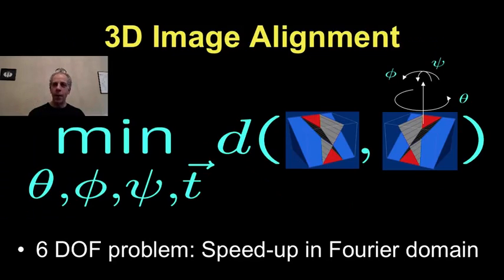Now, I want to reiterate to you, all this is done in 3 dimensions. These 100 by 100 by 100 cubes, we have like 4,000 of them. Sometimes we have 10, 20,000 of them. So a lot of computations. We need to align everybody with everybody. We need to compare everybody to everybody. We need to do that many, many times.